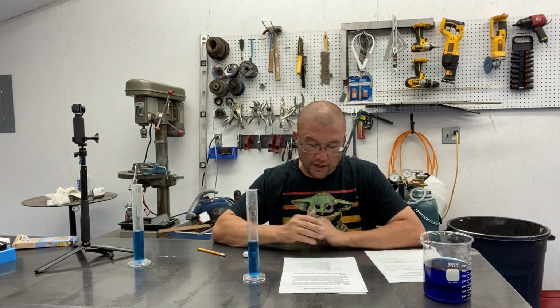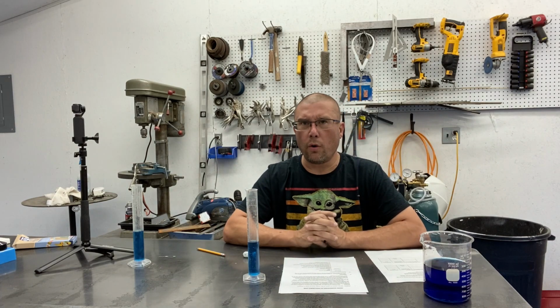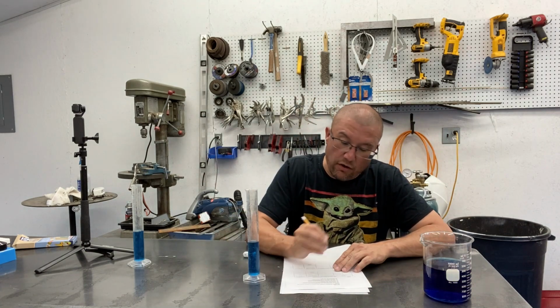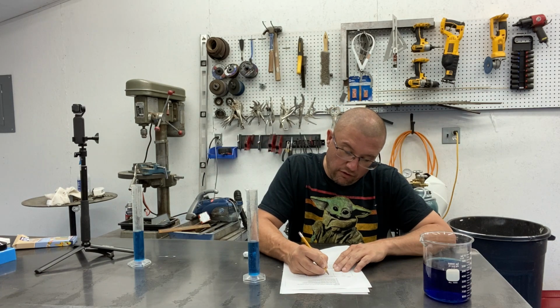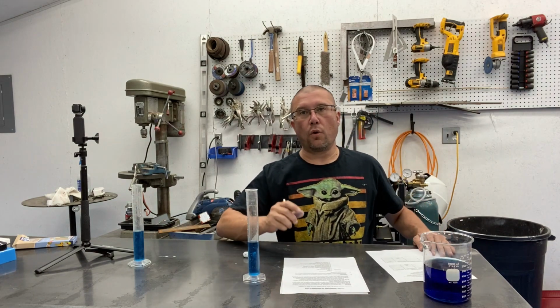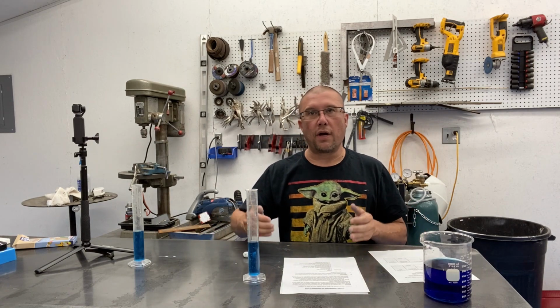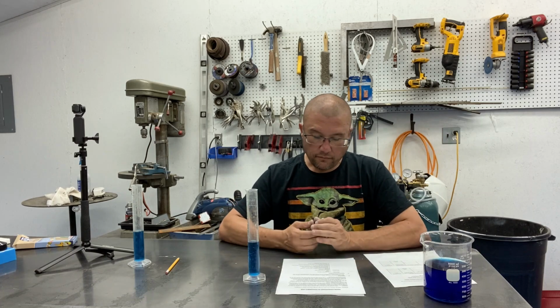So now that we've got a graduated cylinder filled with 50 milliliters of water, we need to record this value in our data table. So you're going to write that down under data table 1, trial 1, volume of water in milliliters. When you do so, make sure you always also record your units. Don't just write 50. You have to write 50 milliliters or mL, or your values are not correct.